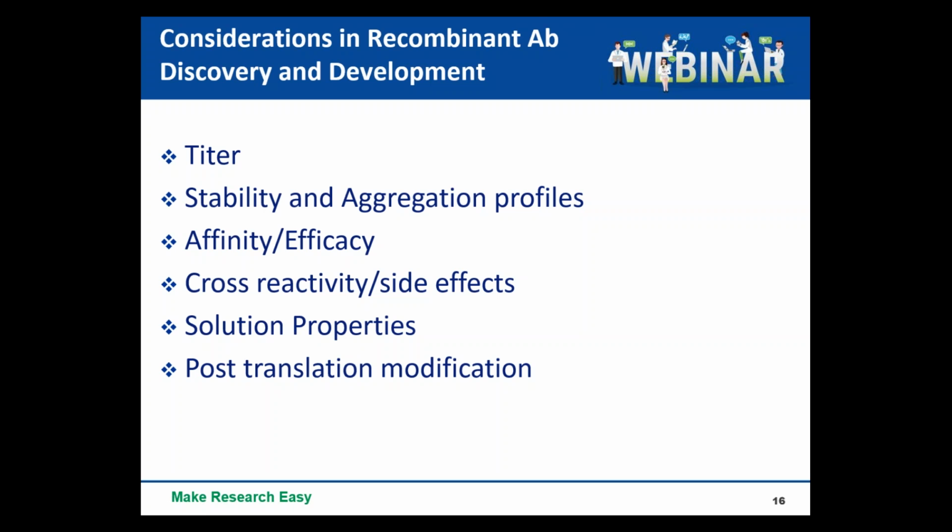Essentially, you don't want to end up with a good functional antibody which tends to aggregate very easily, or tends to go bad very easily because it has lots of post-translational modification during process development. And we also need to look at the cross-reactivity to the same family members of the target to avoid any possible side effects, or to the same targets of other species to help you decide what kind of animal models you could evaluate.